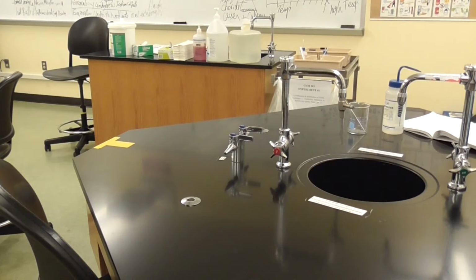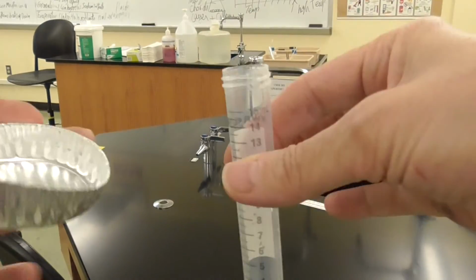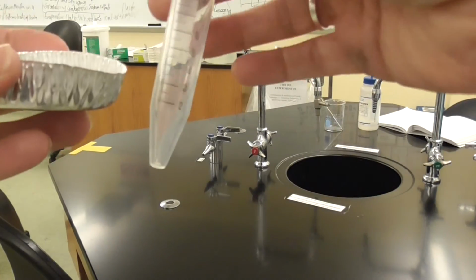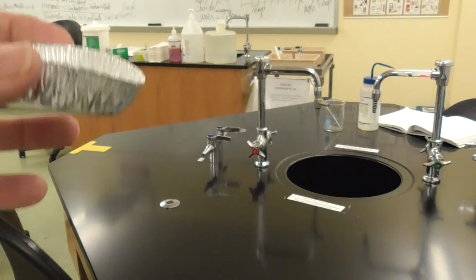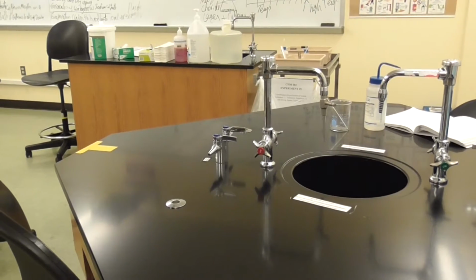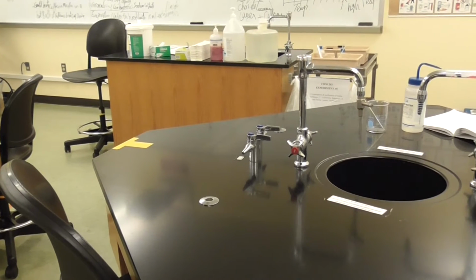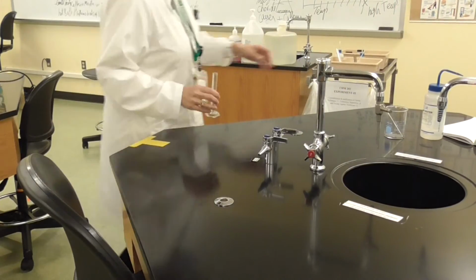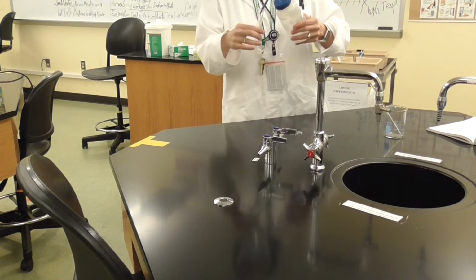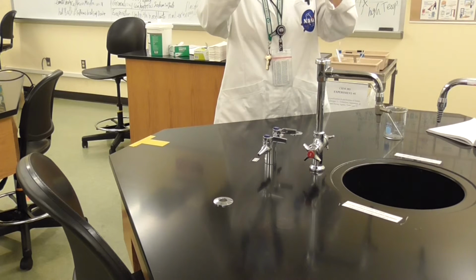So here we are. Now we are in the process of measuring 70 milligrams of the caffeine. We're going to add it into the centrifuge tube, and then we are going to add 4 milliliters of water. With this cylinder, I'm going to measure 4 milliliters of distilled water.